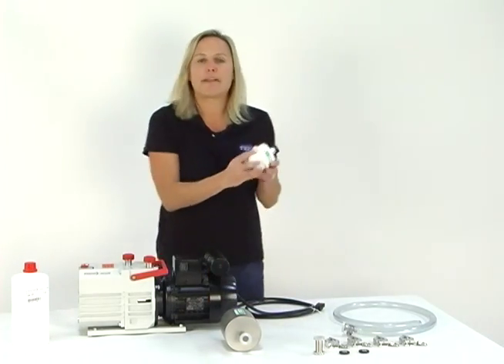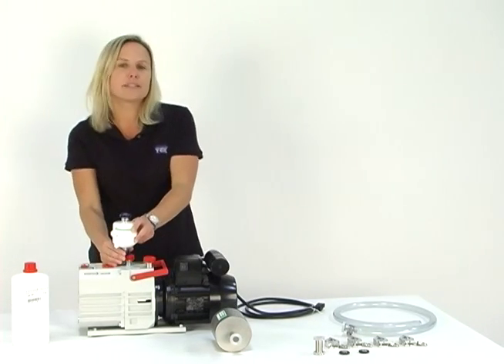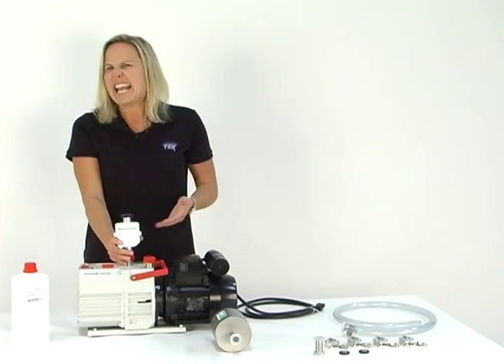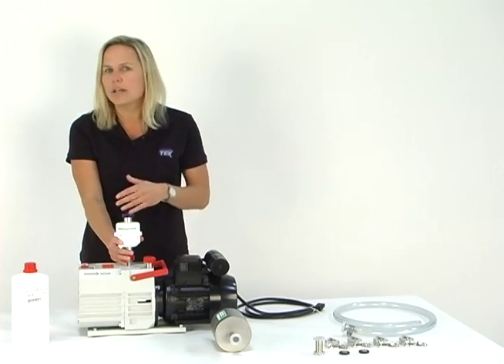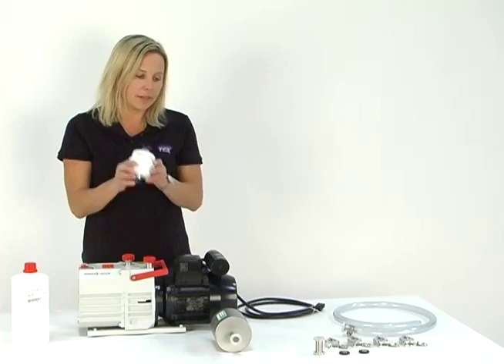The next thing we have here is what's called a mist eliminator. Now the pump has an exhaust. This mist eliminator goes on the pump exhaust, and what this does is it traps and filters out any other gunk that the pump wants to exhaust. Sometimes you might see a little smoke, sometimes a little water mist — it just depends on what you're putting through the pump. So this is called the mist eliminator.